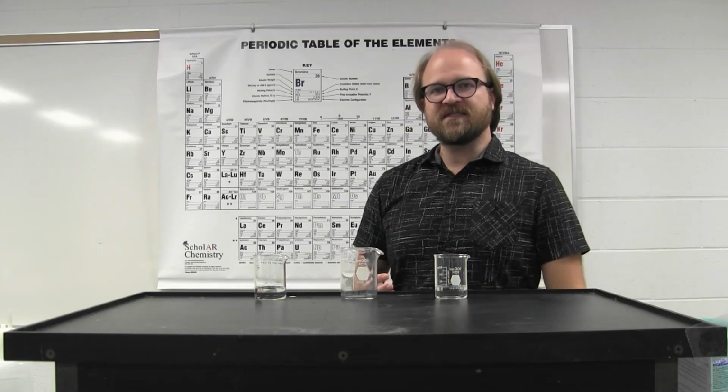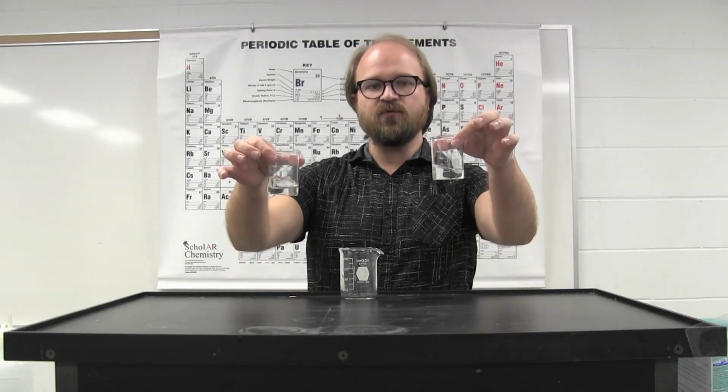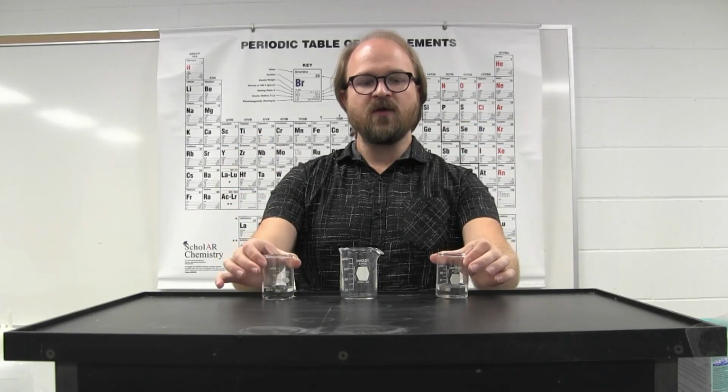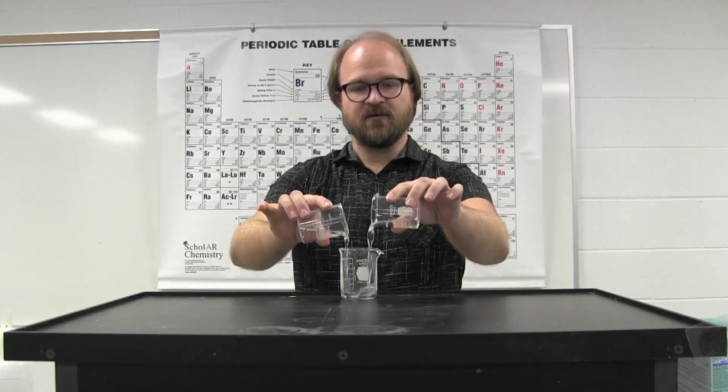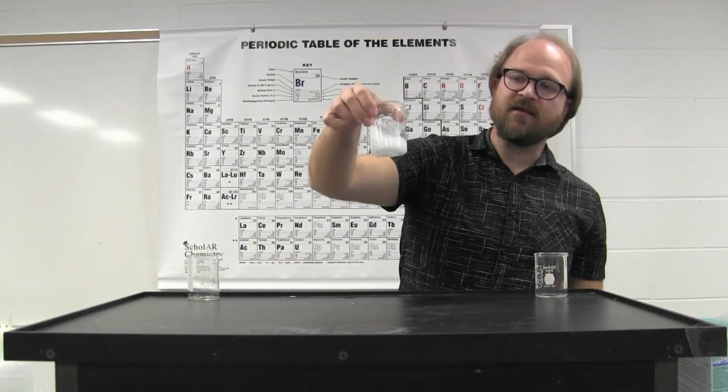In part B of the experiment, you're focusing on precipitation reactions. And you have seen precipitation reactions in a number of the experiments before. And a precipitation reaction is where you have two completely clear liquids, and when you mix them together, it forms a solid.